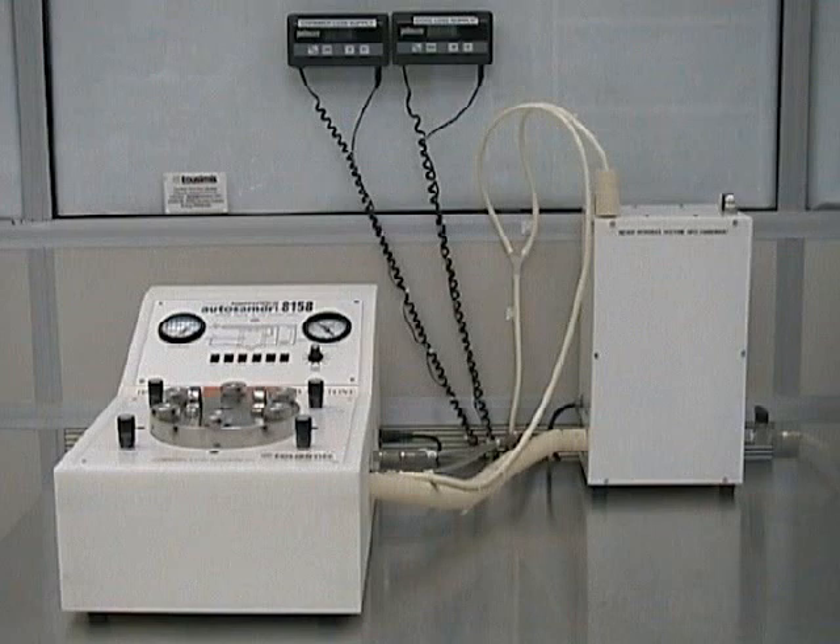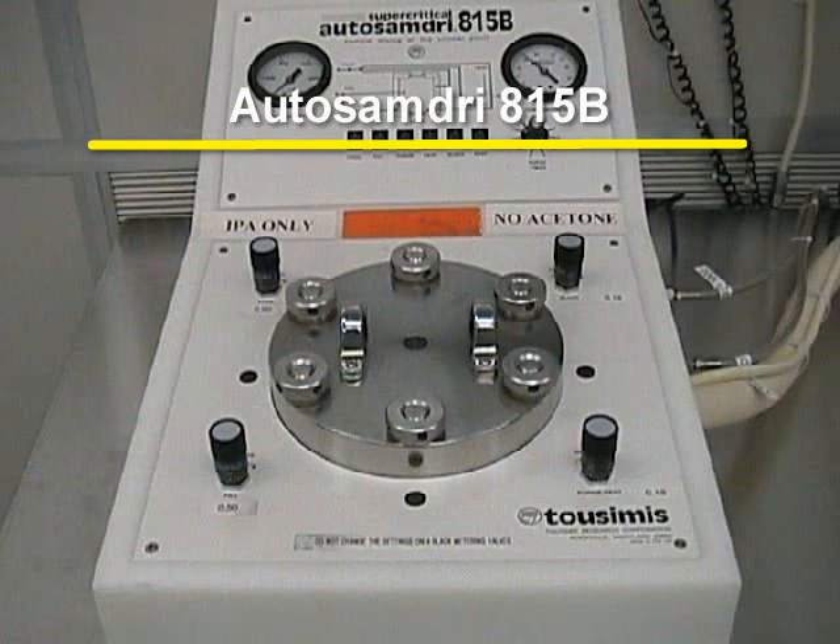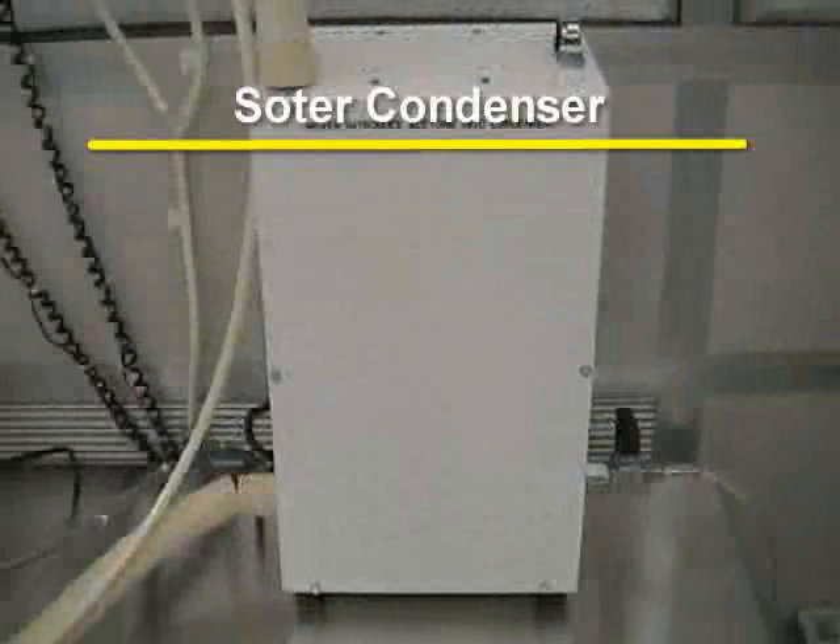Let's now get familiar with the various parts of the supercritical dryer. There are two main pieces to the entire unit. The AutosamDry 815B is where the processing takes place. The process chamber and all the process controls are located on this piece of the unit. The solvent condenser captures the exhaust and alcohol during processing.